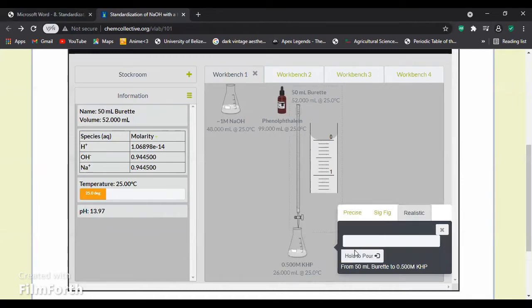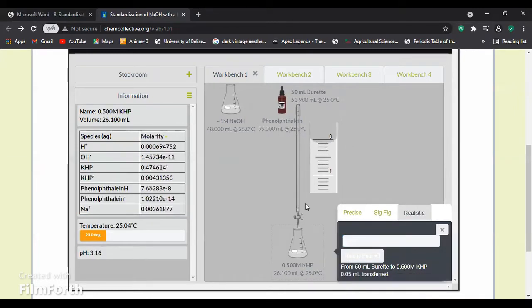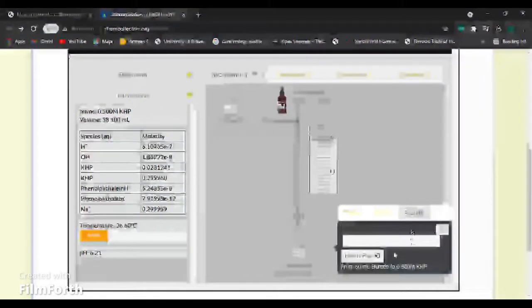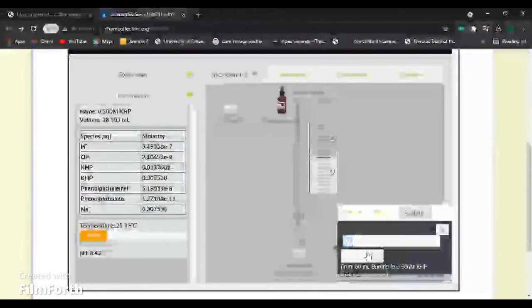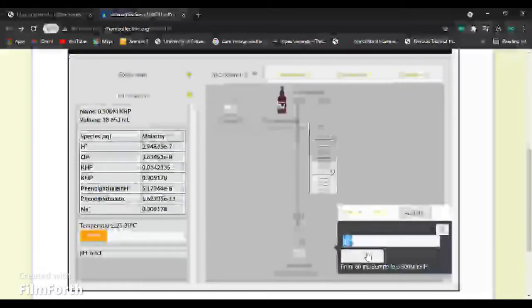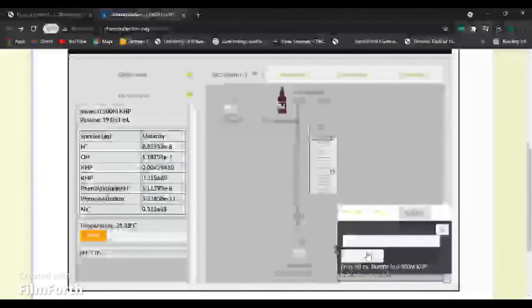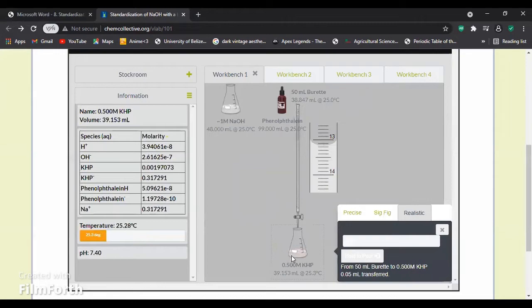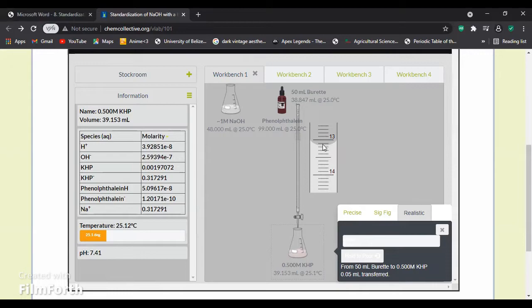We will pour until we see a color change in the solution. Now we can notice that a slight decoloration in the solution has occurred, so that means that titration has occurred. So now we will proceed to record the volume, which was 13.1.